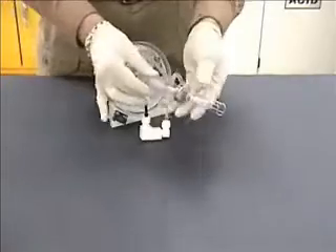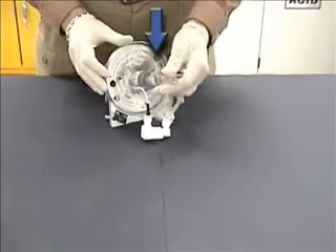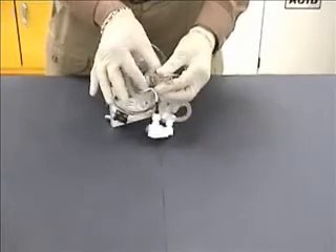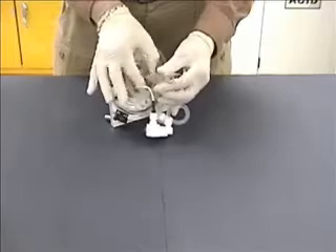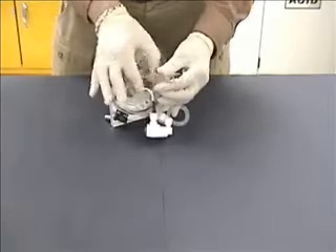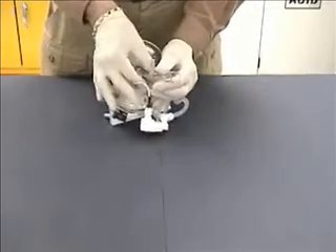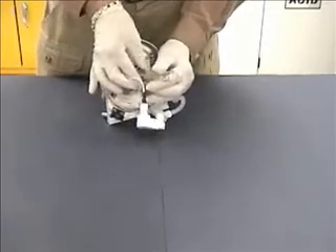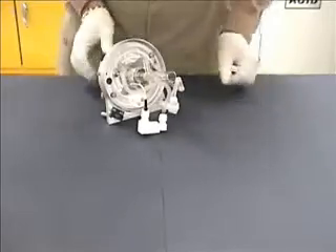Insert the torch adapter onto the torch mount with the gas tube stubs pointing up. Slide the O-ring, Teflon spacer, and internal Z adjustment nut into position and tighten the Z adjustment nut. Verify that the torch quartz and adapter are firmly attached to the torch mount.